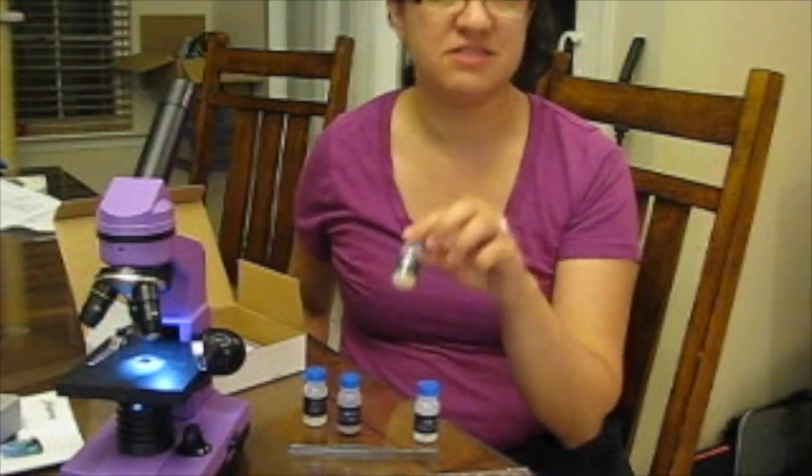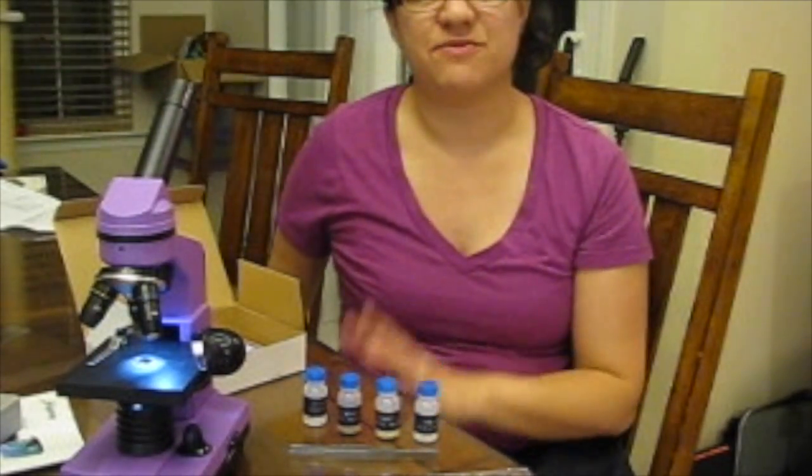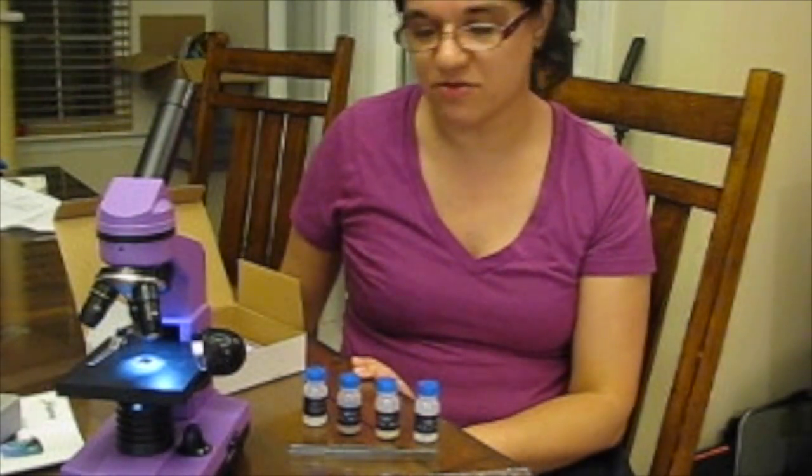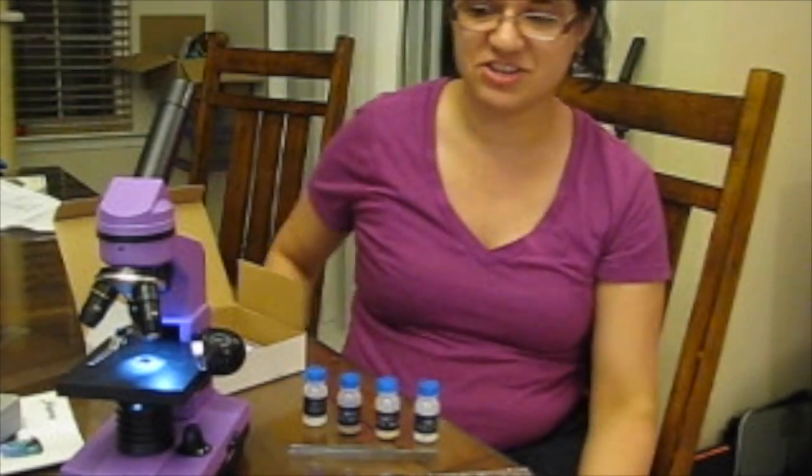With the yeast you can do experiments of different levels of sugar in the water that they're growing in, and it just keeps going.